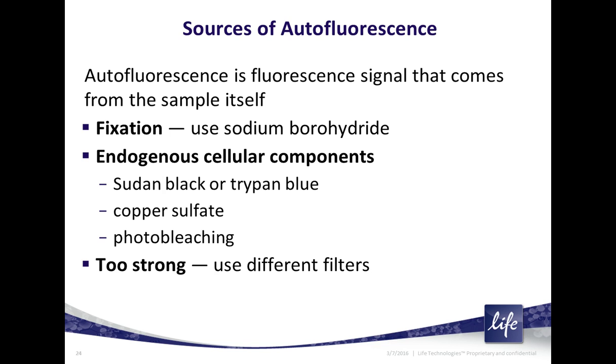You make it extremely fresh, so you put in your PBS, vortex it, and put it on your sample. And in tissue, you'll see it fizzing. And then after 10 minutes, you make up your next tube, very fresh, and put it on, and then you do it a 3rd time. This especially helps in the green and red wavelength.